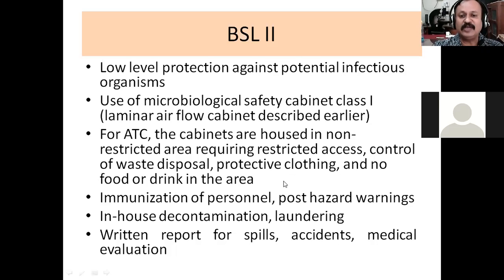Then protective clothing must be worn by the person who is going to work in this facility. Again, there is no provision for any food or drink in that area. The persons who are going to work in this facility should be immunized properly, right? And hazard warnings should always be posted. There should be, for example, stickers or small posters which tell you what precautions should be taken in the laboratory.